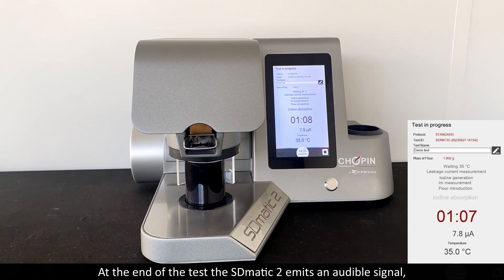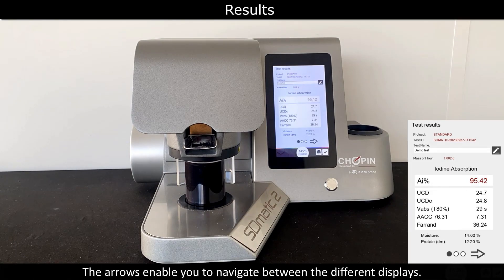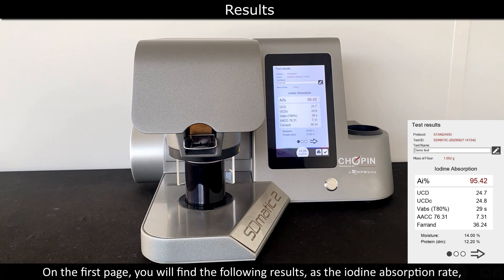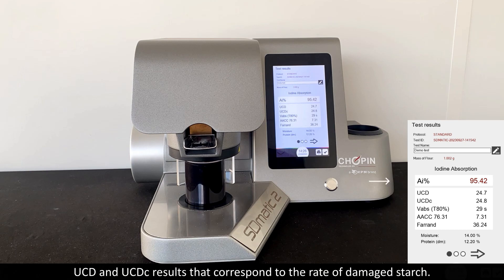At the end of the test, the SDmatic 2 emits an audible signal and the software displays your results. The arrows enable you to navigate between the different displays. On the first page, you will find the iodine absorption rate, UCD and UCDc results, which correspond to the rate of damaged starch.